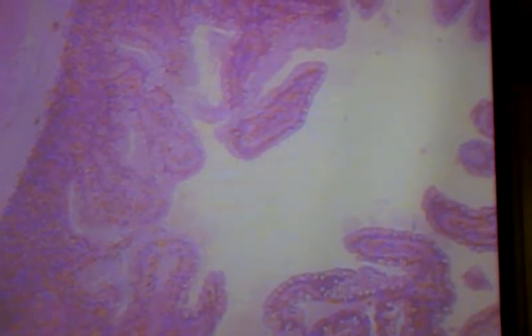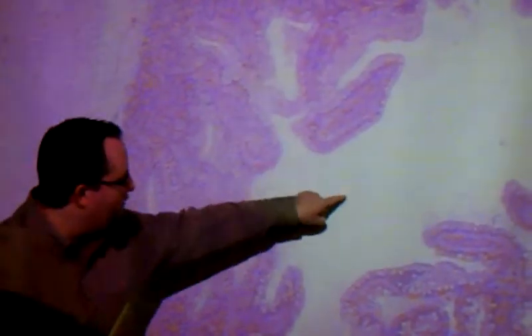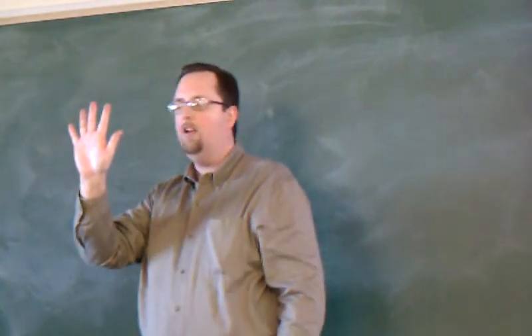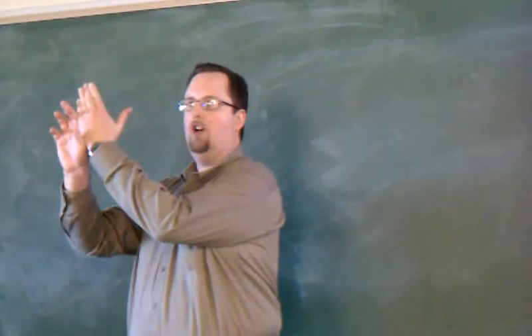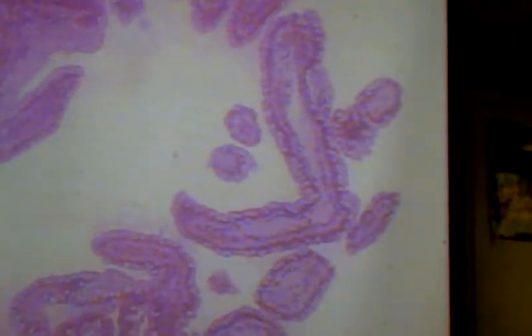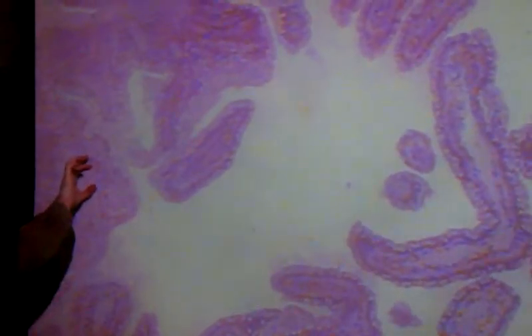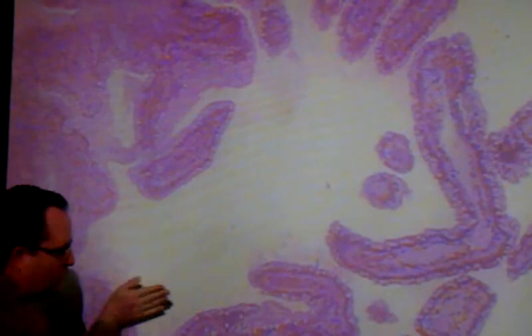Now in your book, they'll show you a textbook perfect depiction of the mucosal layer with finger-like villi sticking up in a nice row. Well, these villi are soft structures — they fall over and get folded and bent. Imagine if your fingers are villi in the small intestine and the blade cuts them along their length, then you see them down their length. But if the blade chops across them, you see things like apparent junk hanging in space. Those villi are attached — we're just not seeing the attachment points. They may be going in or out of the screen and connecting back to the rest of the mucosa.